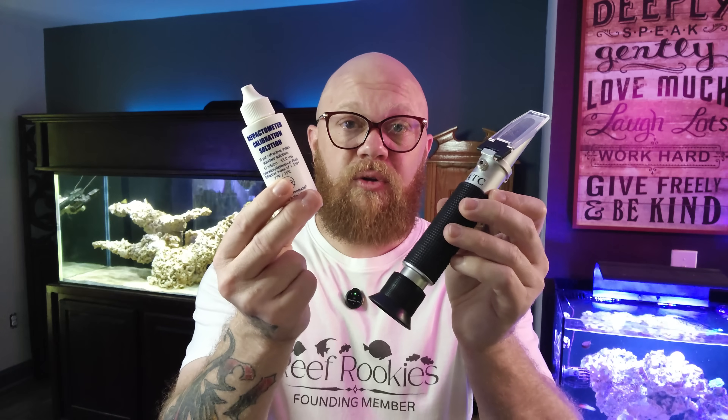But if your refractometer is not an automatically temperature-calibrating refractometer, there is an extra step: you need to match the temperature of the refractometer to the temperature of the calibration solution or the tank. One way to do that is to float the bottle in the tank for about 15 minutes to make sure the calibration solution is temperature-matched. Then put the solution on the refractometer, close the lid, and wait about 30 seconds before taking your measurement. With a non-ATC refractometer, you have to match the temperatures — if you don't, your measurement is going to be off because temperature matters.